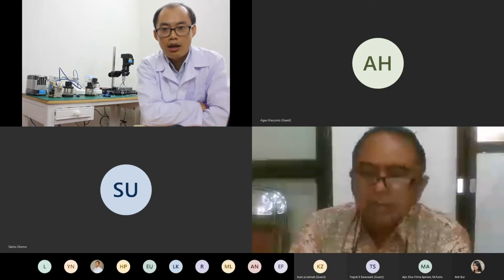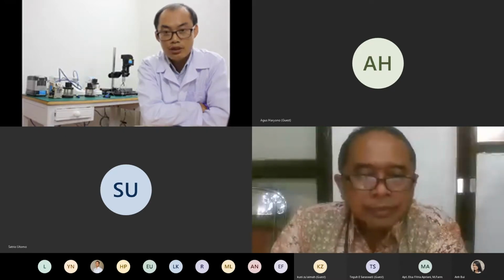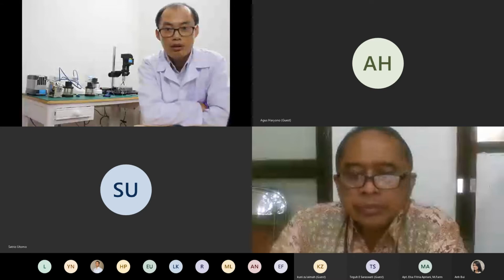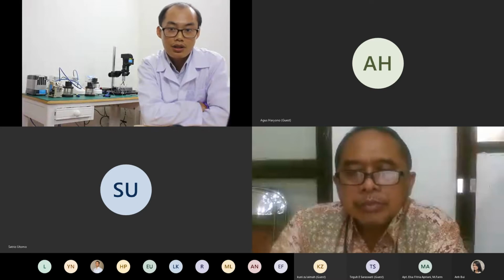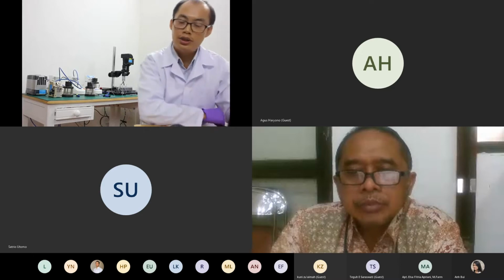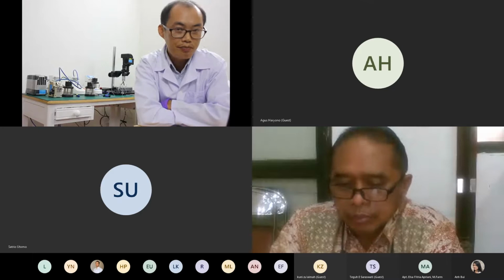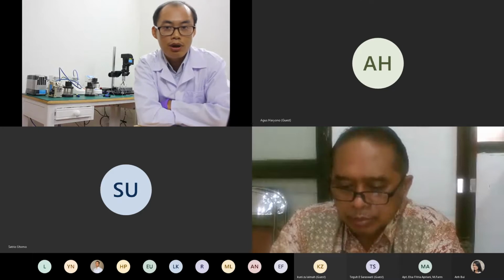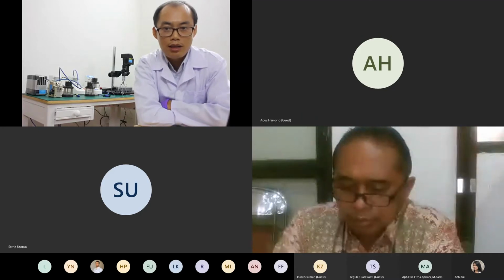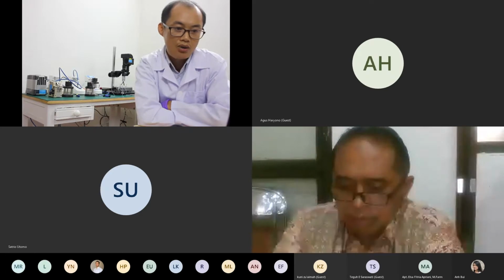So today we would like to talk about droplets and particles generation by using microfluidic technologies and its applications. It will include three sections. The first section will be a presentation. The second section will be the live demo section, and the third section will be Q&A, question and answer.